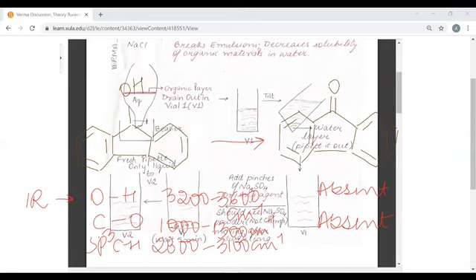But what we do have are the sp2 carbon hydrogen peaks, which is not a very good feature to distinguish the two of these. The OH, C single bond O, and the C double bond O peak in your product are your three differentiating peaks of IR that can help you decide which is which structure.